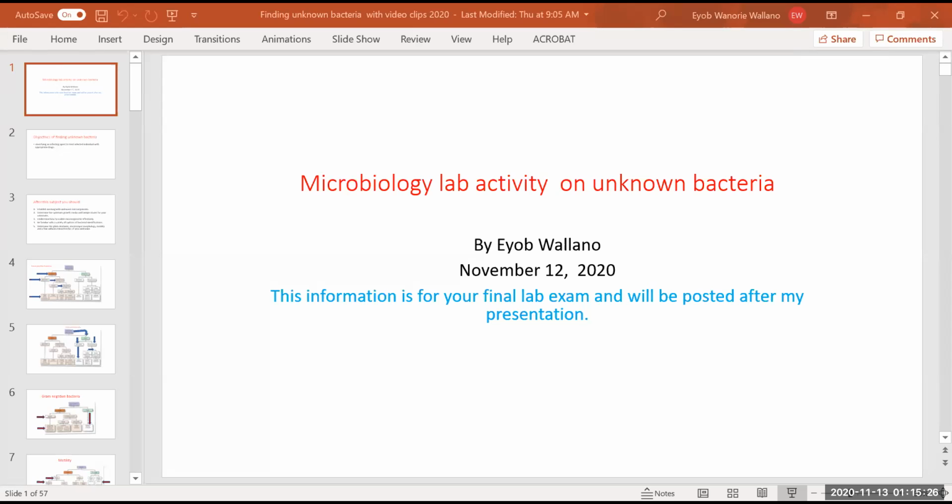Okay, I'm going to present you certain steps which you need to know on microbiology lab activity, especially how to find unknowns. Any information which I'm going to give you, I will give you at the end because there are some students who may come late to the website.